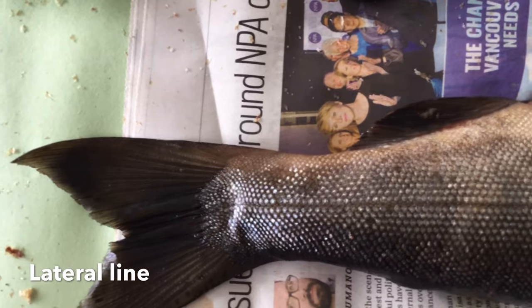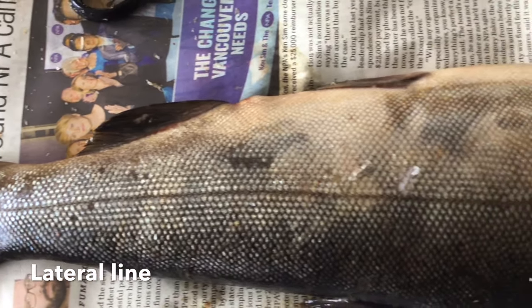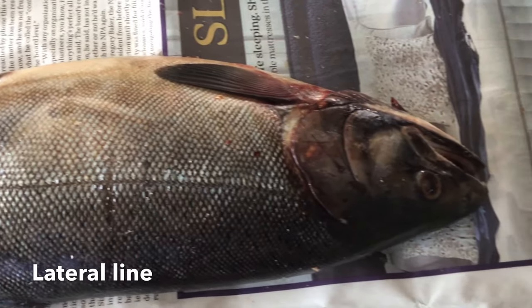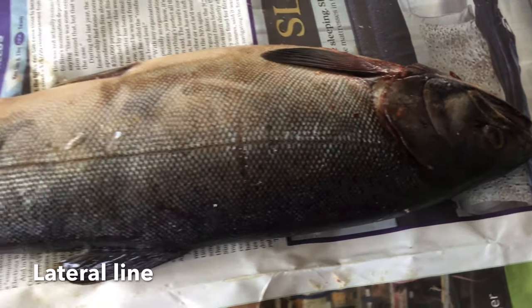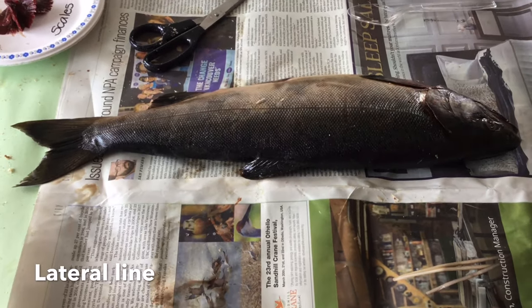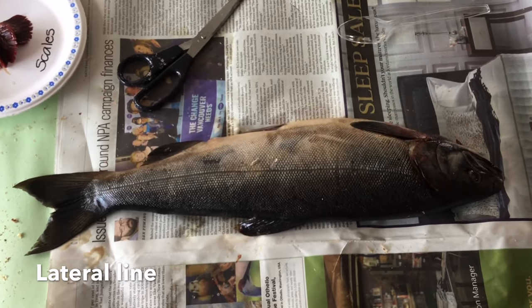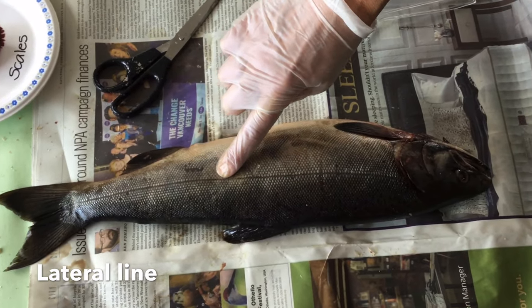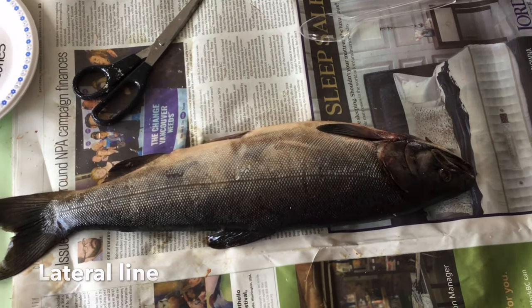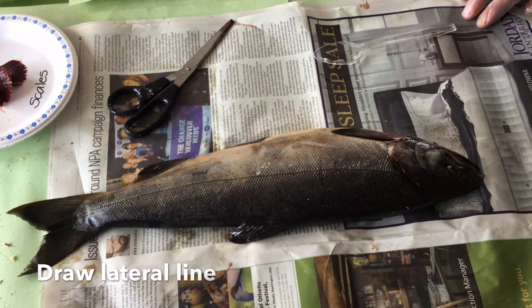In the lateral line, we're going to just see the whole breadth of the lateral line. That line is a series of liquid-filled canals below the skin along the side of the fish. This line is very important for the salmon. It helps the salmon detect sound waves and disturbances in the water. It also helps the salmon judge distances and find its way in dark or muddy water. Go back to your original drawing and put the lateral line on it.